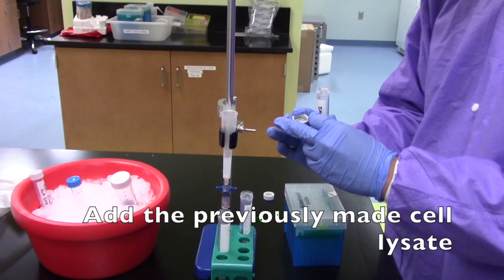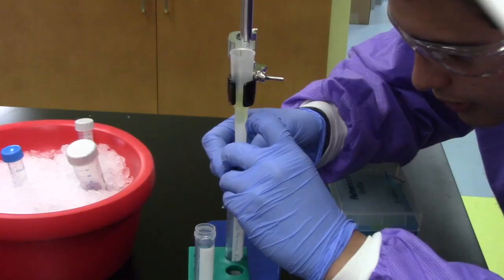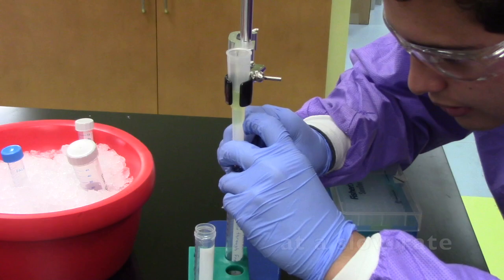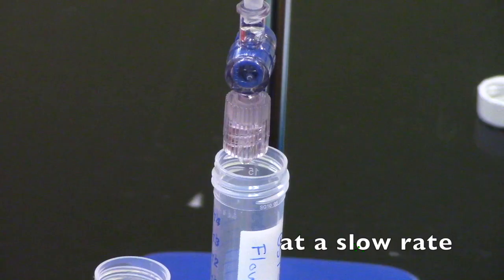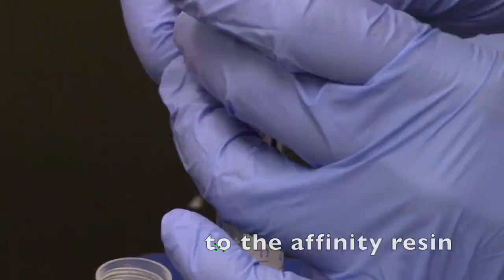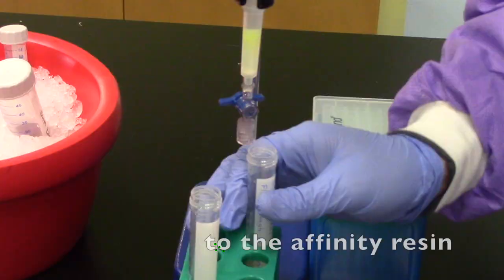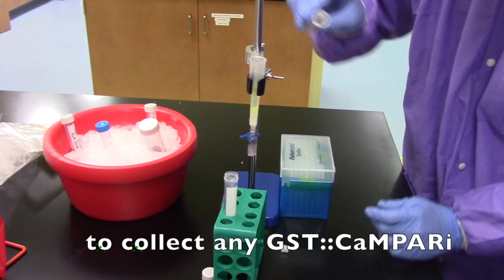Add the previously made cell lysate. Allow it to flow through at a slow rate. This enables efficient GST Campari binding to the affinity resin. Add this flow through again to collect any GST Campari that was not previously bound to the affinity resin.